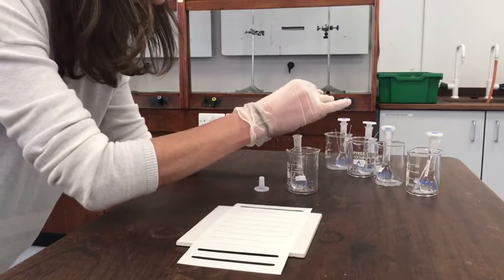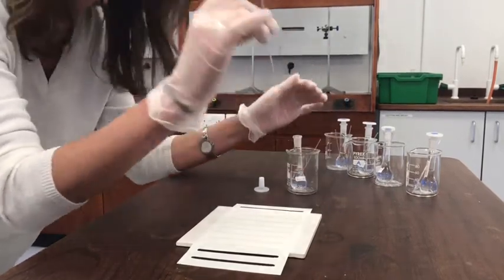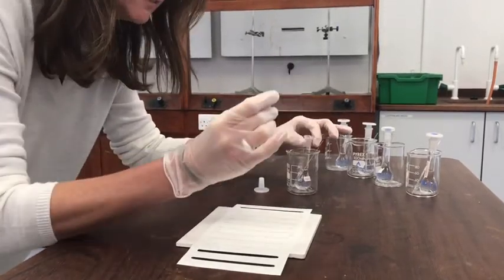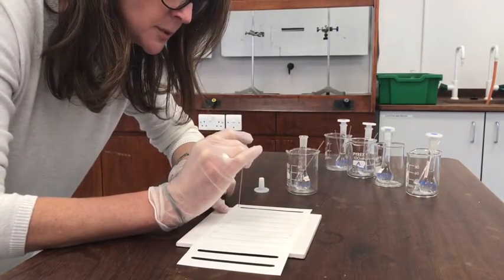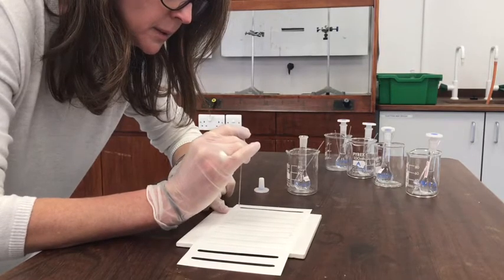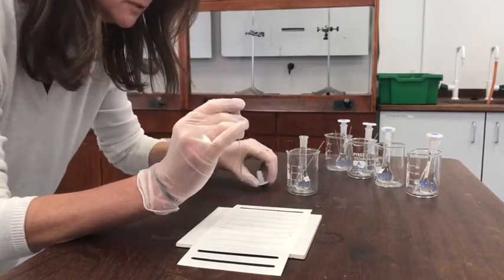We use a little capillary tube — put your finger over the end to stop it sucking up too much — then into the liquid, and spot carefully onto the paper. I've drawn a pencil line on there, as always, because we don't want ink being run up the paper when we put it into the solvent.